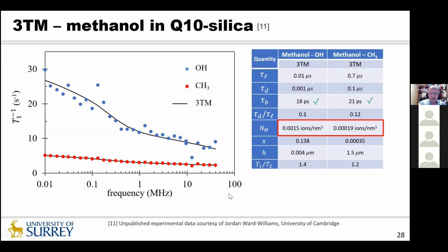Well, the explanation for this, I think, is absolutely clear. This gives you the orientation of the molecule at the surface, and the OH group is pointing downwards, which is what you'd expect, I think, because the OH is the more ionic part of the molecule. So that explains that. I'm going to give myself 2 ticks for that particular set of results.